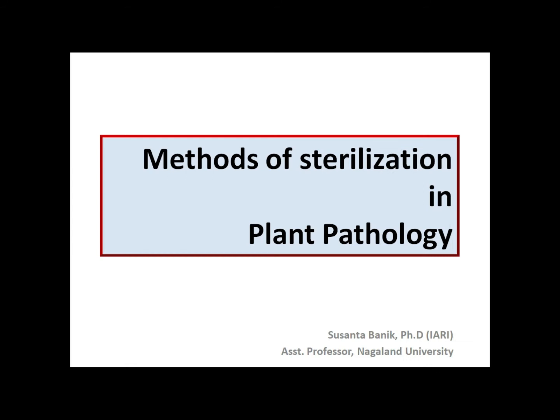Hello everyone. Today's topic is methods of sterilization in plant pathology. Sterilization is the most basic and essential activity in a plant pathology lab. There are microbes in every possible place around us.